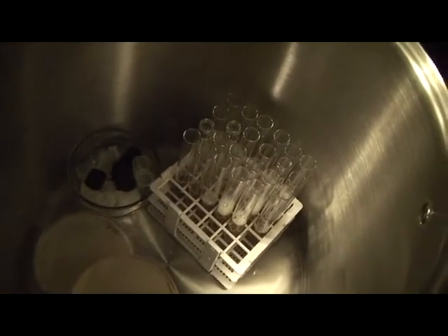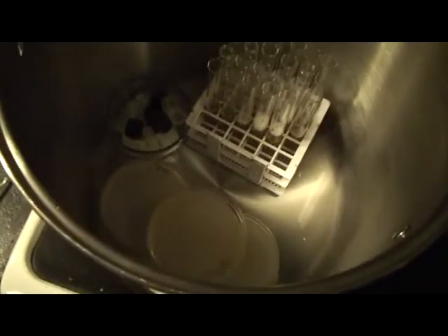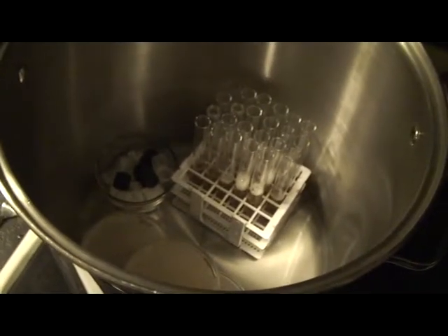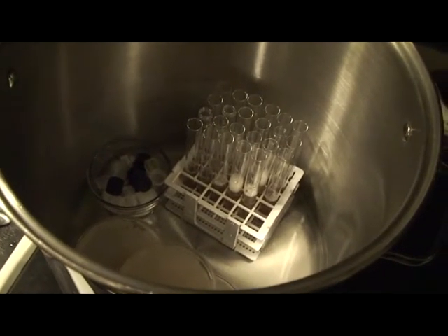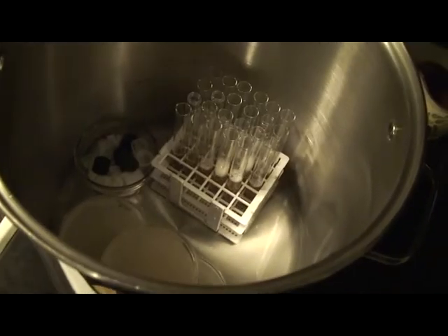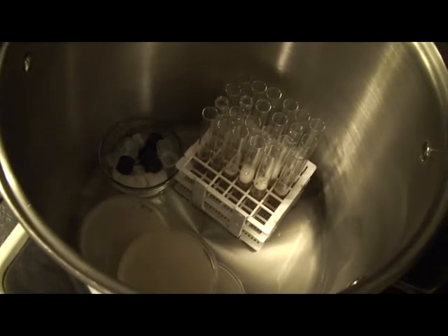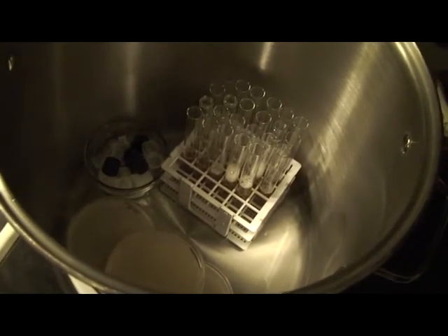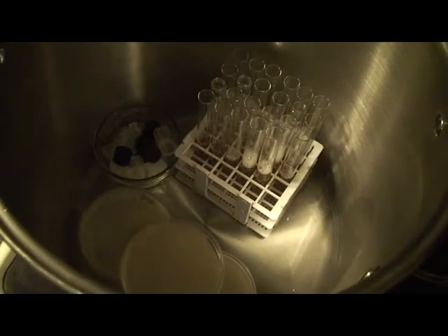Here we have our pot on the stove — it's our standard boil kettle. We have all our slants standing straight up with our caps. We're actually making some petri dishes so AJ can cultivate some wild yeast. We're going to put a top on this, get it boiling, creating steam, and leave it for 15 to 20 minutes. If you have a pressure cooker, that's better by all means, but we don't have one. This is an acceptable way — we've not had any slants get contaminated due to sanitation. Knock on wood.